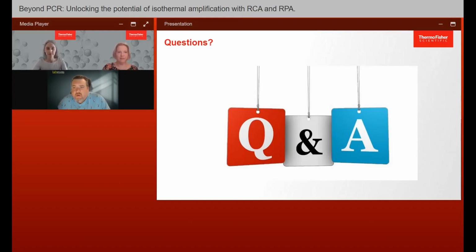All right. One more here for you. Could you make a comparison of the amplification specificity of those above isothermal amplification methods: RPA, RCA, MP-RCA, MDA?